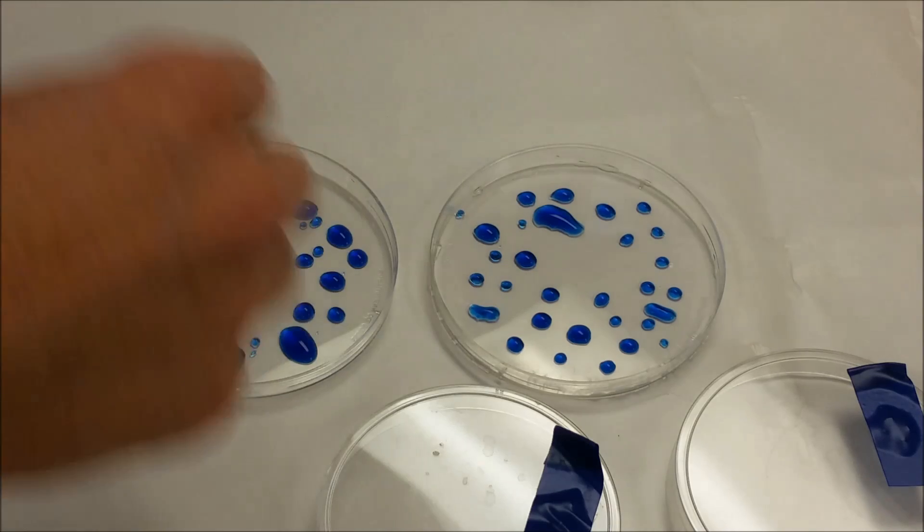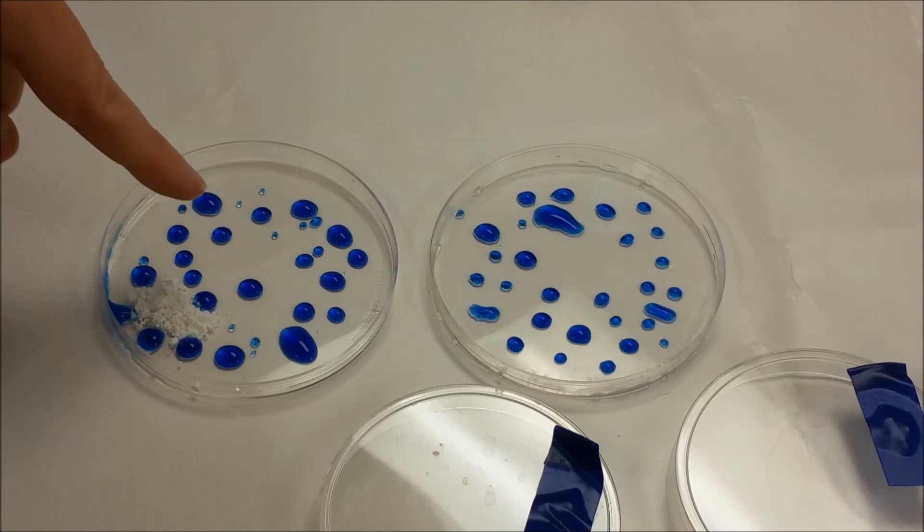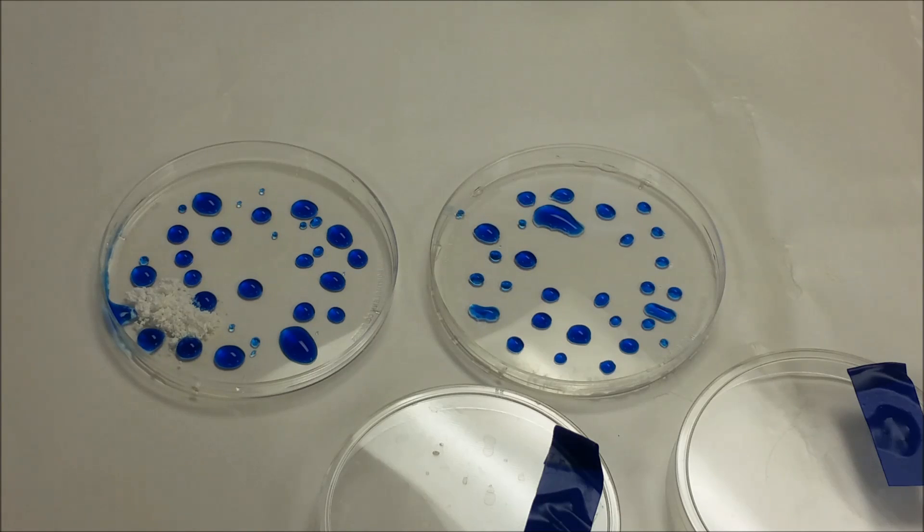I'm going to mix two chemicals in the center of the bromo-cresol green. The bromo-cresol green is blue under basic conditions, and it will be green under neutral and yellow under acidic.